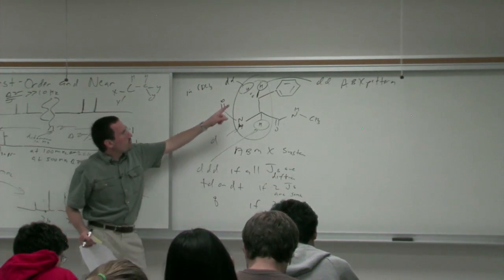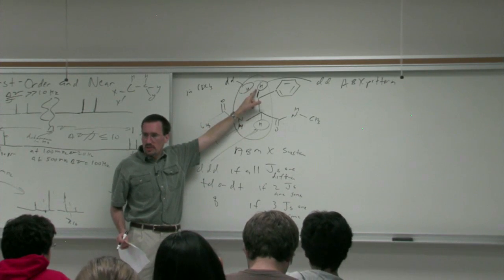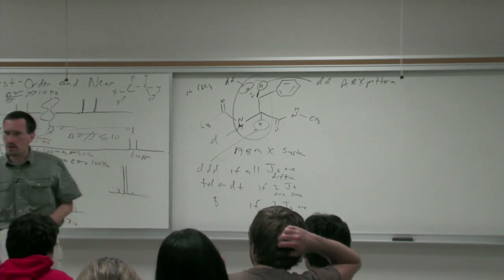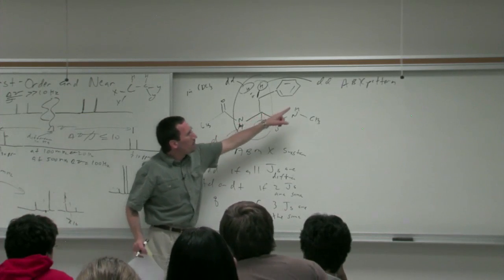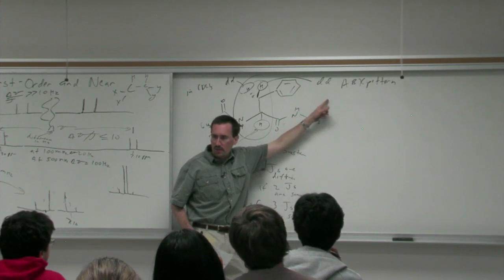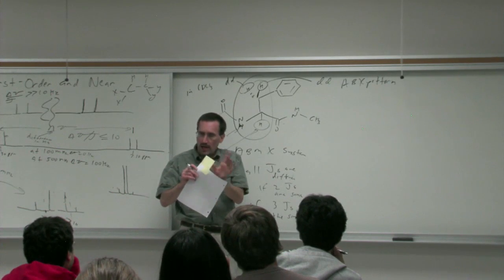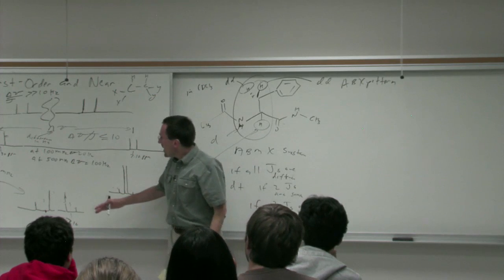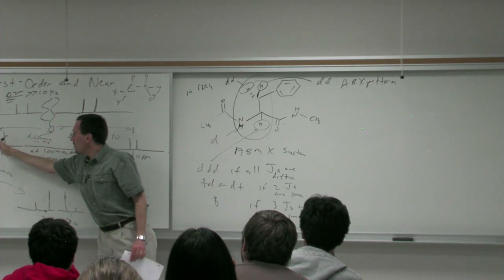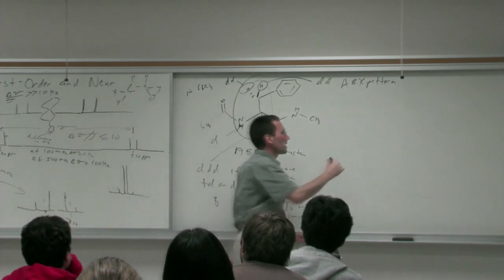So the one I really want to draw our attention to then is these 2 hydrogens here. Because now this type of AB pattern really can serve as an archetype for more complex patterns that are non-first order but are close to first order. So an ABX pattern is something where you have the AB pattern in which each line is further split. So imagine this type of pattern here with some level of separation, but now with each of these 2 lines split into a doublet.